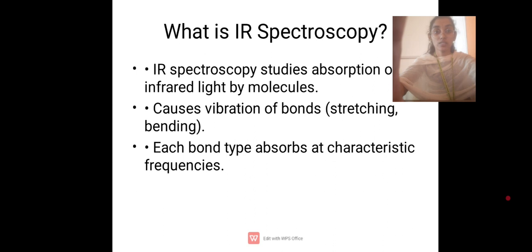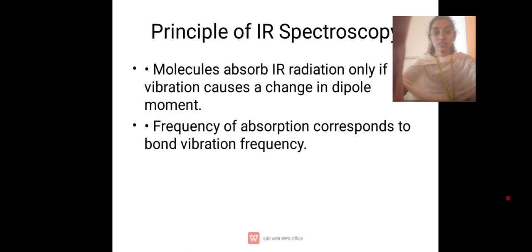What is IR spectroscopy? IR spectroscopy studies absorption of infrared light by molecules. It causes vibration of bonds like stretching and bending. Each bond type absorbs at characteristic frequencies.